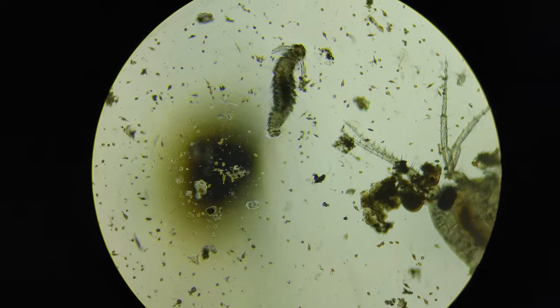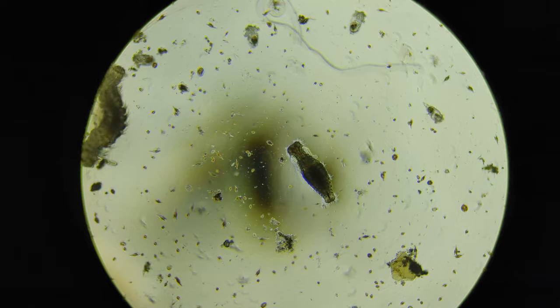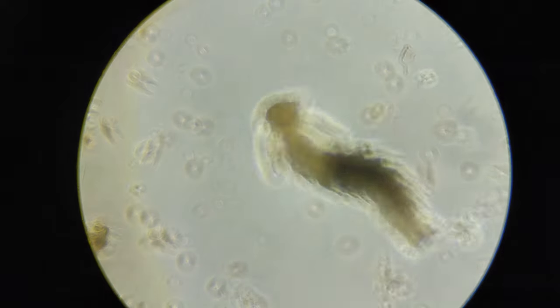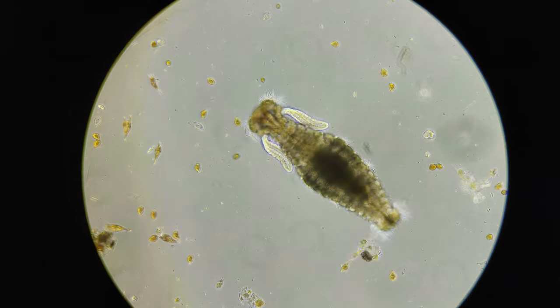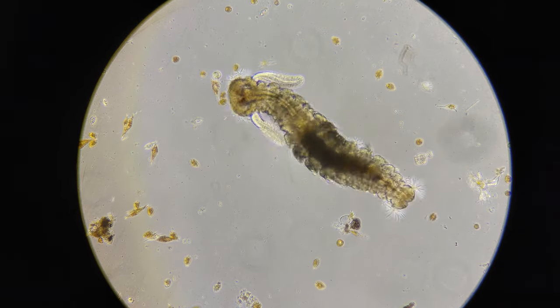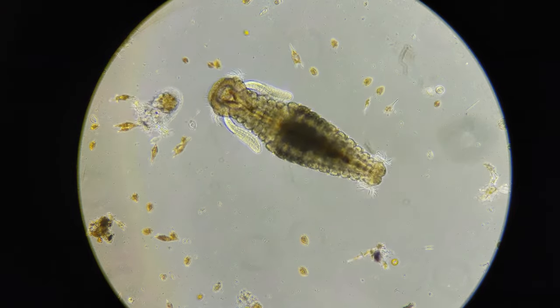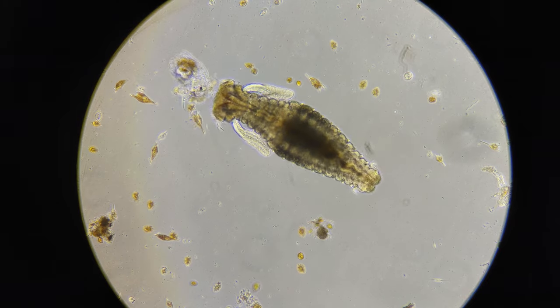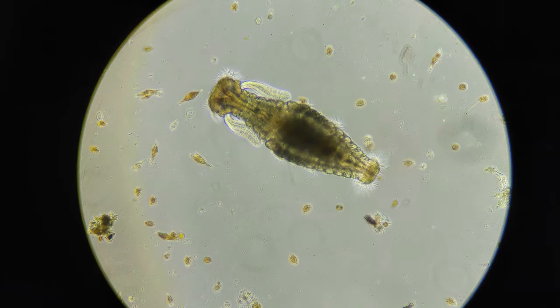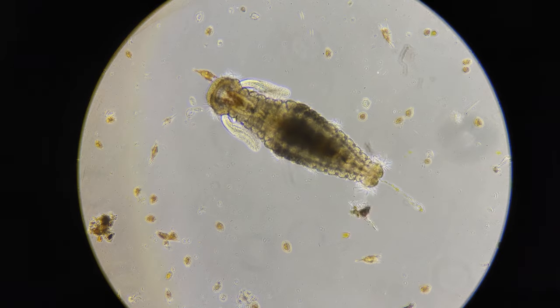I believe this fuzzy worm is the larva of a polychaete worm. Polychaetes include bristle worms and fire worms, and you can see it has those fine hairs on the sides which is characteristic of polychaetes. He's also partially immobilized by the thin film but you can see he has cilia on his front and back and he's using them to suck up some water. I think that's maybe a rotifer he's saying hi to. And those three-pronged brown plankton are dinoflagellates — he just ate one.